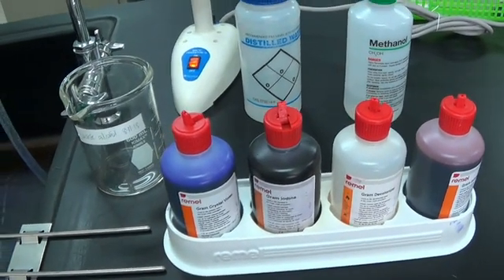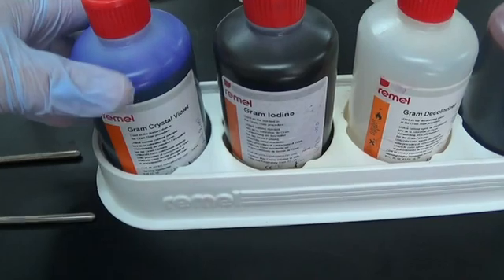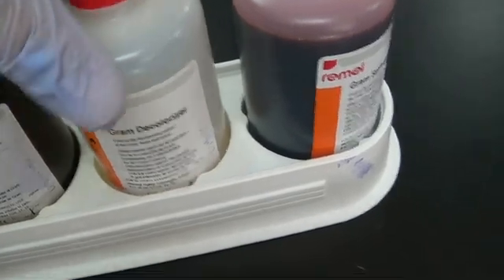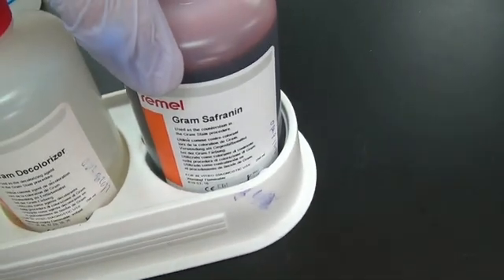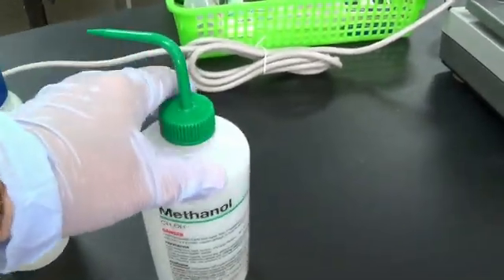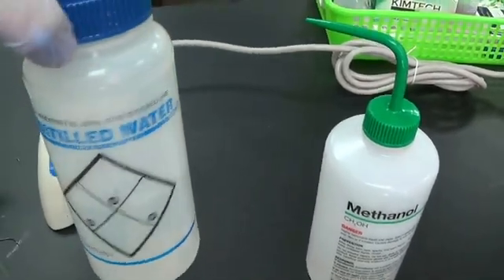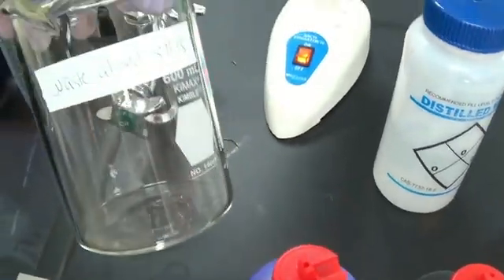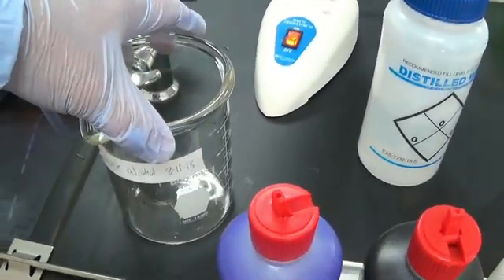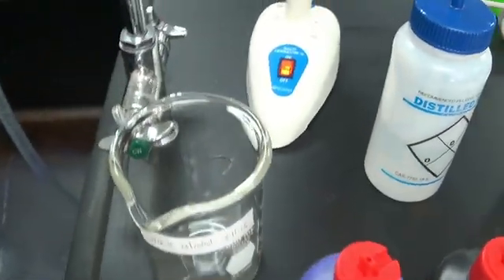These are the supplies for gram staining: crystal violet, iodine, decolorizer, and safranin. I am also going to show how to use a squirt bottle of methanol. I like to use a squirt bottle of DI water. I am going to collect the waste alcohols in a waste bottle — I am not sure if that is required yet, but I will research that. You may want to use an incinerator, and then we have this rack to put your slides on.